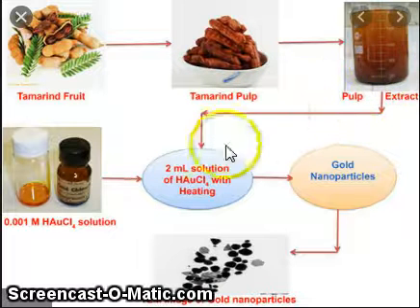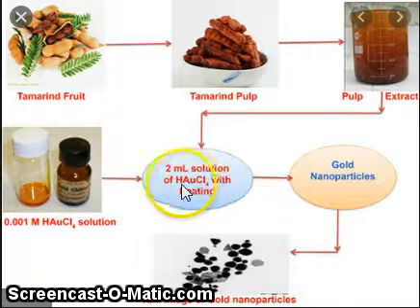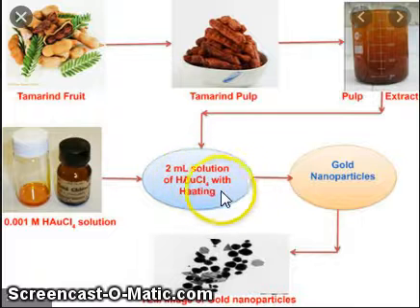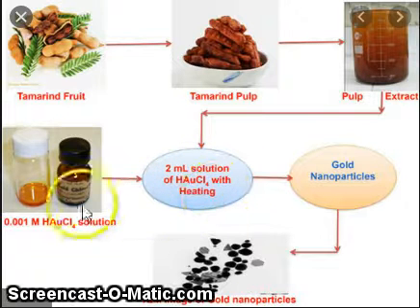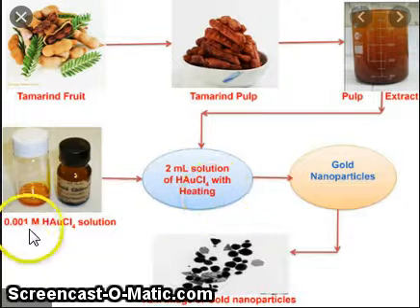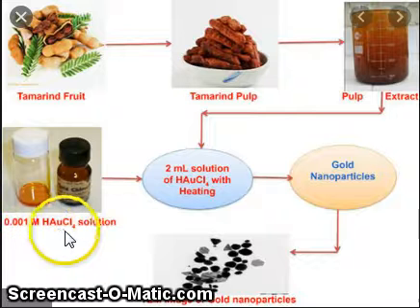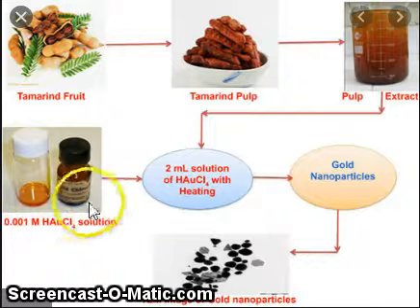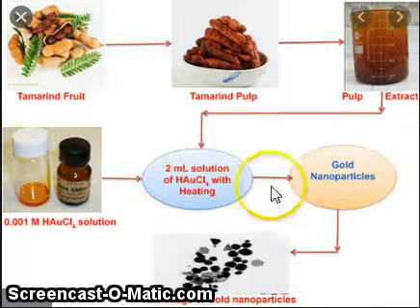Then 2 mL solution of HAuCl₄ with heating — this is the 0.001 M HAuCl₄ solution — you added here.